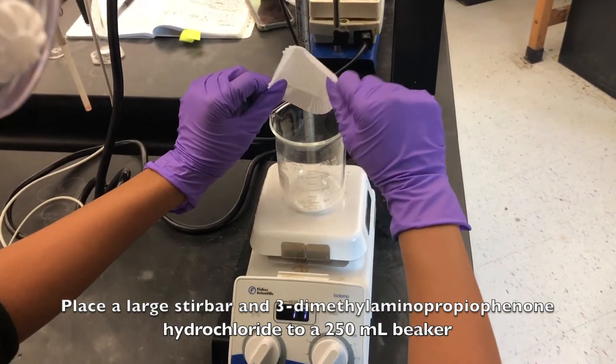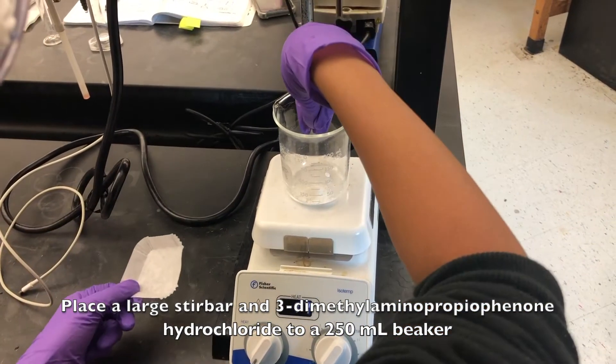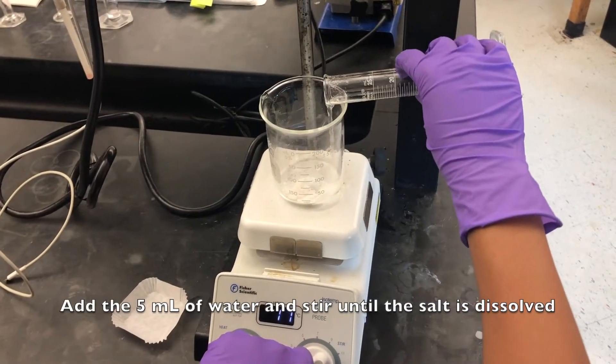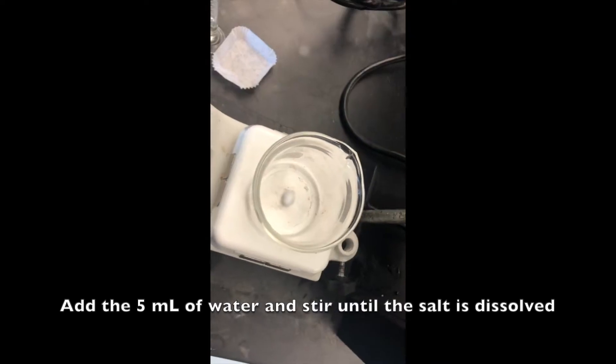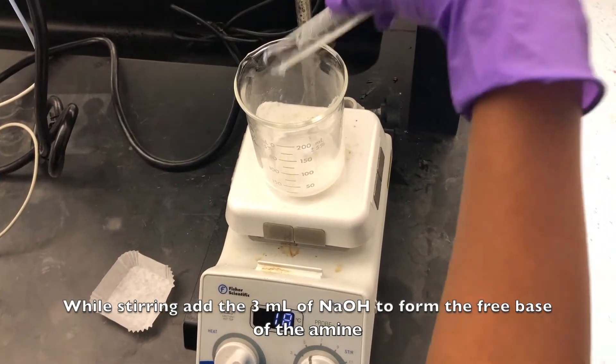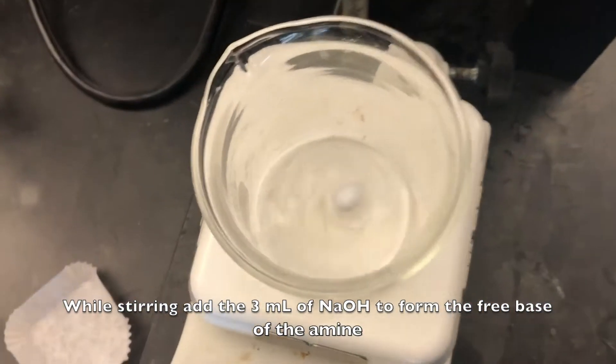Place a large stir bar and the hydrochloride into a 250 milliliter beaker. Add the water and stir until the salt is dissolved. While stirring, add the 3 milliliters of sodium hydroxide to form the free base of the amine.